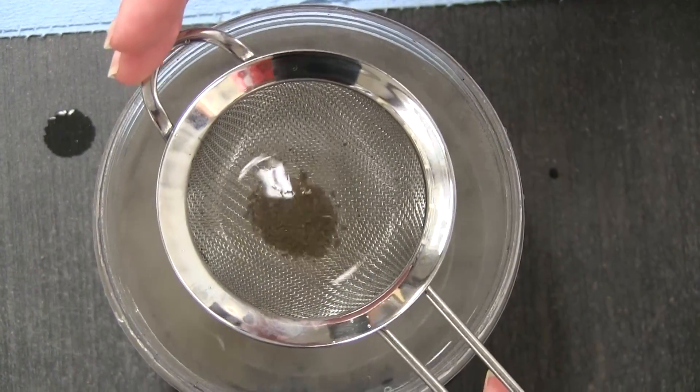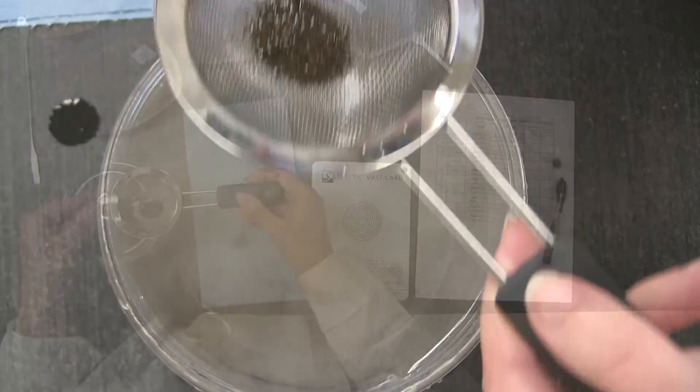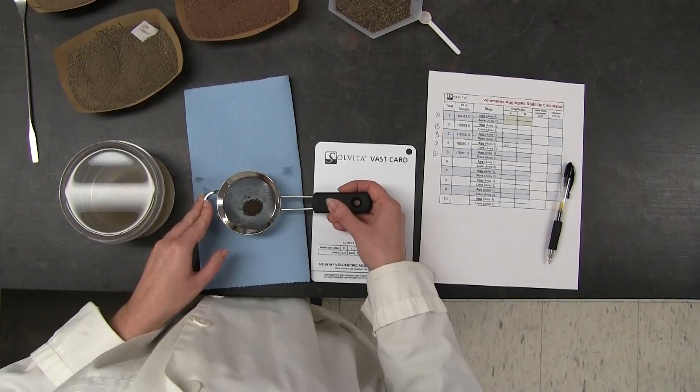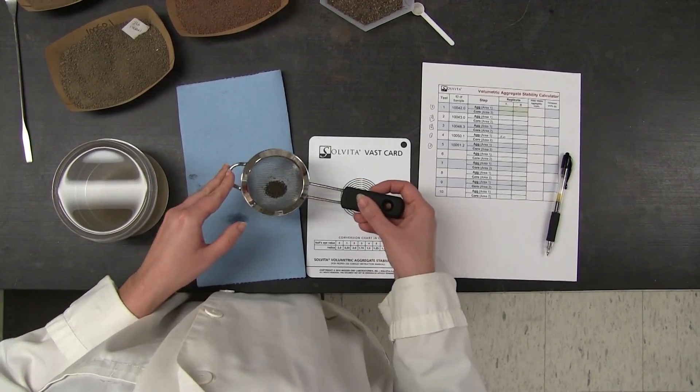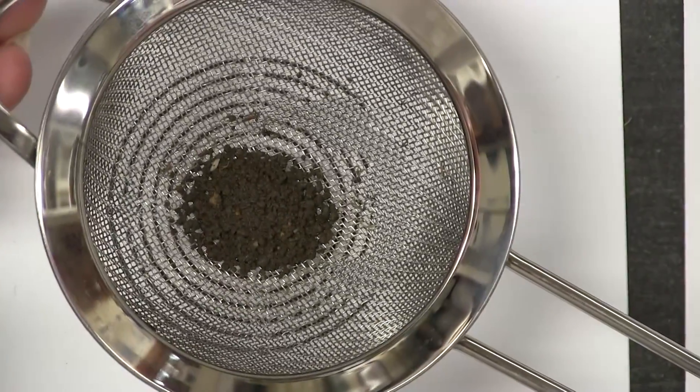So I thought, what if we exploit the volumetric aspect of aggregates and create a new rapid test that any lab can perform? This has resulted in the test we call VAST for volumetric aggregate stability.